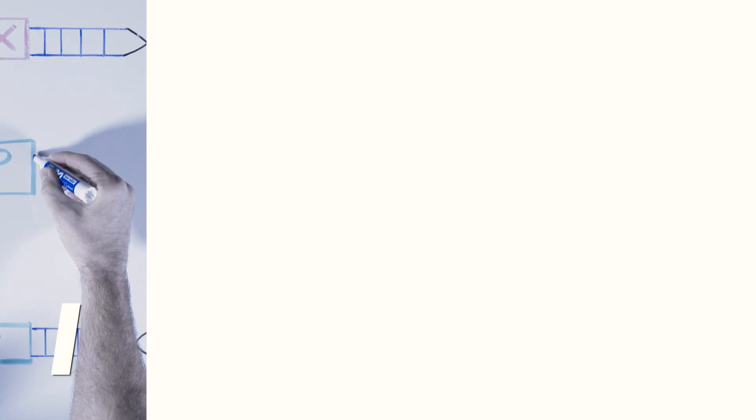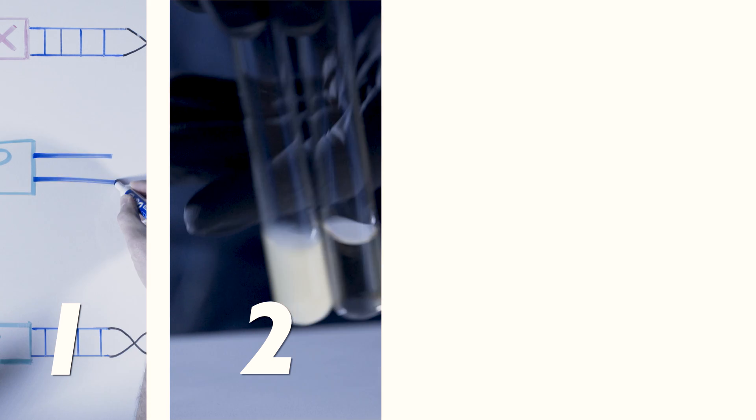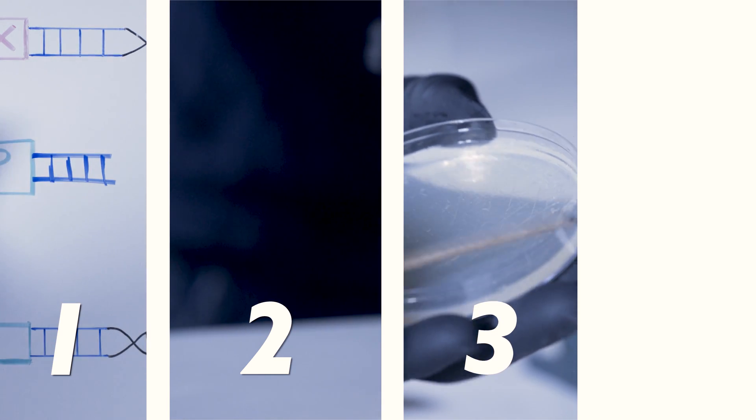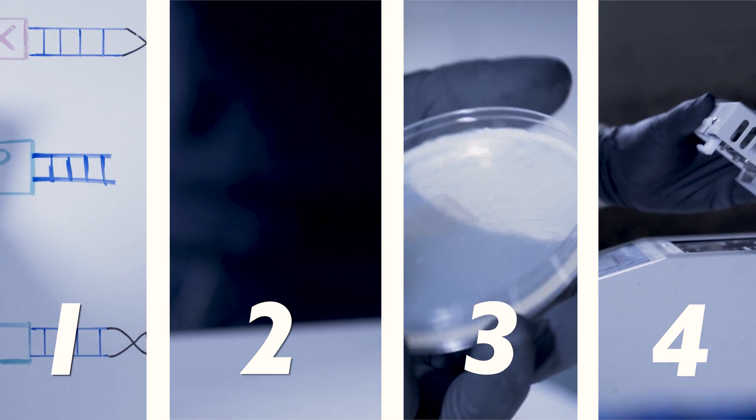We'll break it down into four steps. First, we'll design our genetic strategy and order our new DNA. Second, we'll prep our bacteria and add the new DNA. Third, we'll isolate and modify the bacteria. And finally, we'll check to make sure our final strain works.